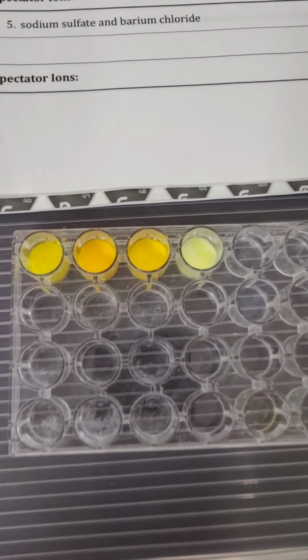We're back for our second row. We're going to take some copper sulfate. And now some barium nitrate, and see what happens. Number 7 is aluminum sulfate.